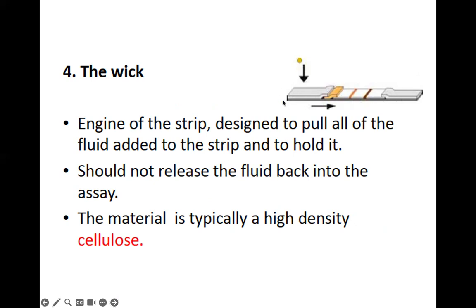But the issue is if you put too much buffer, then it might dilute your sample.